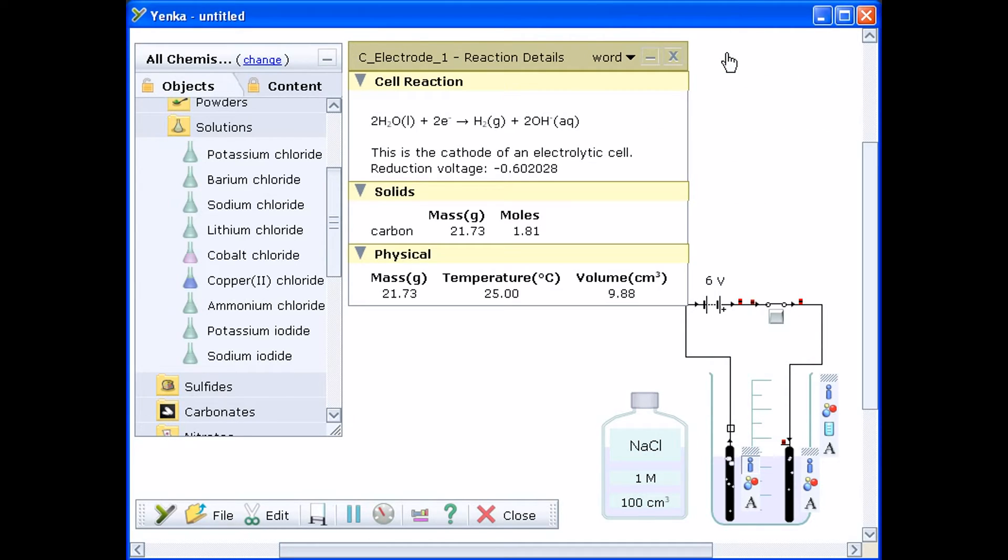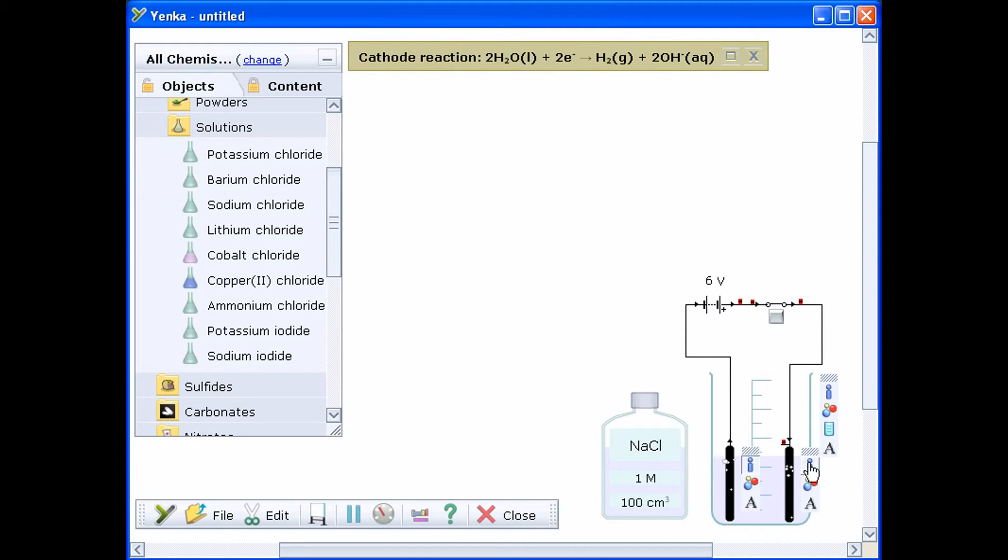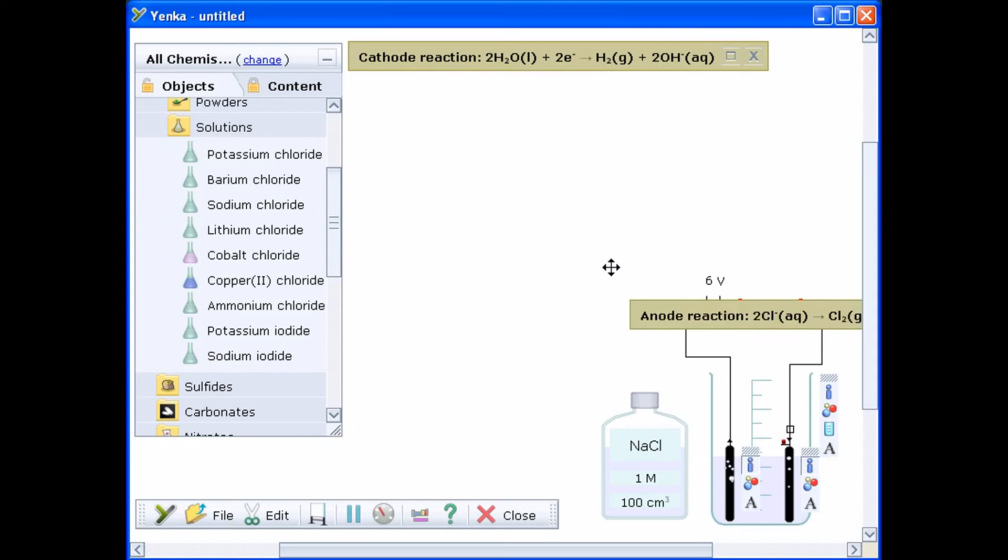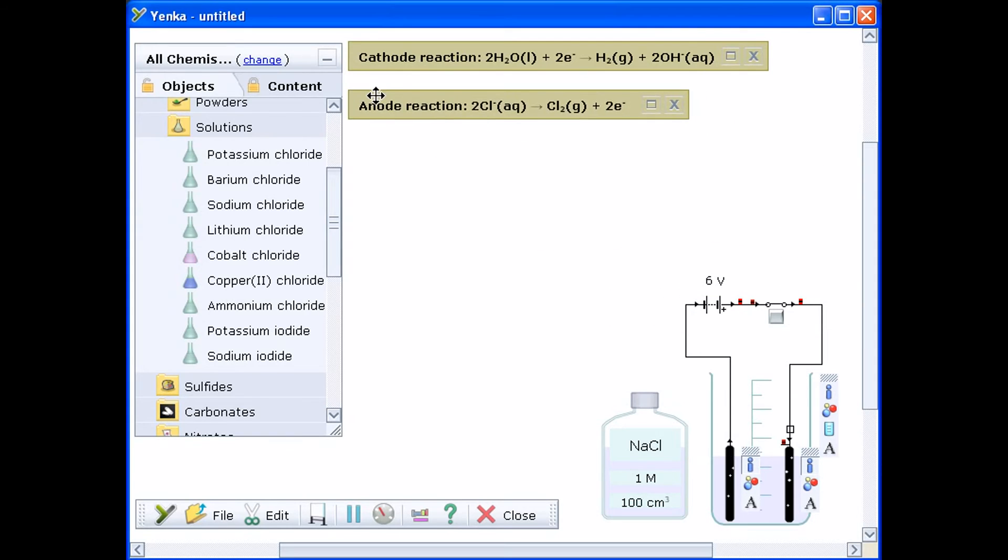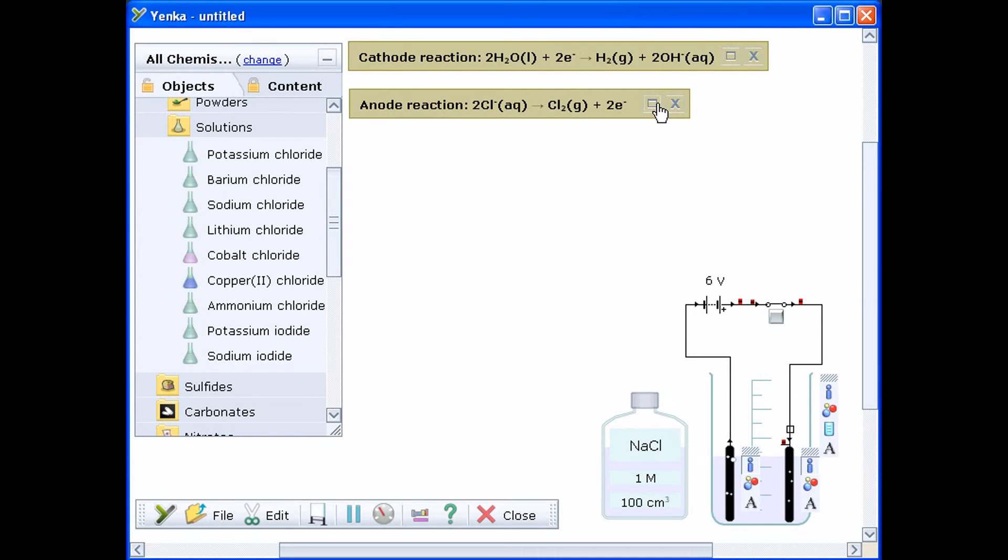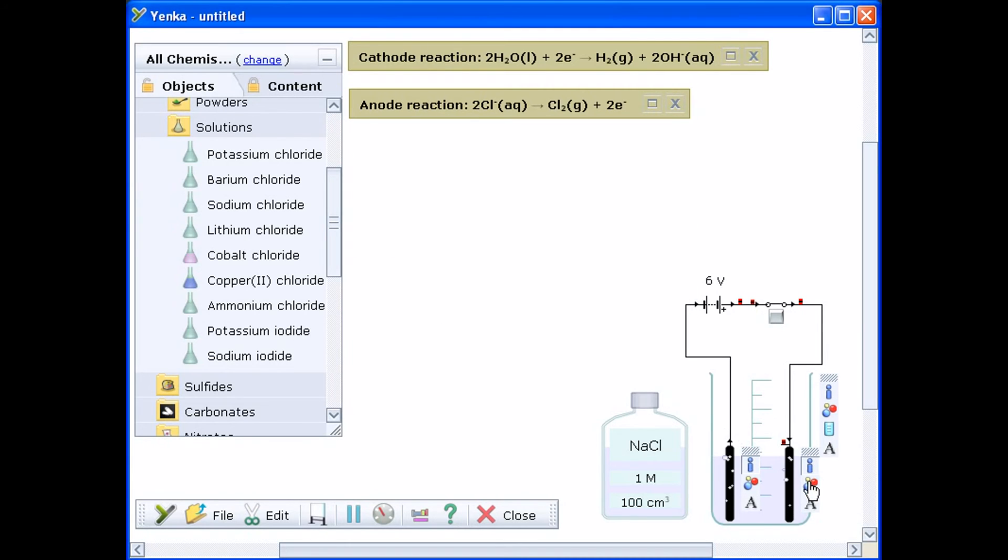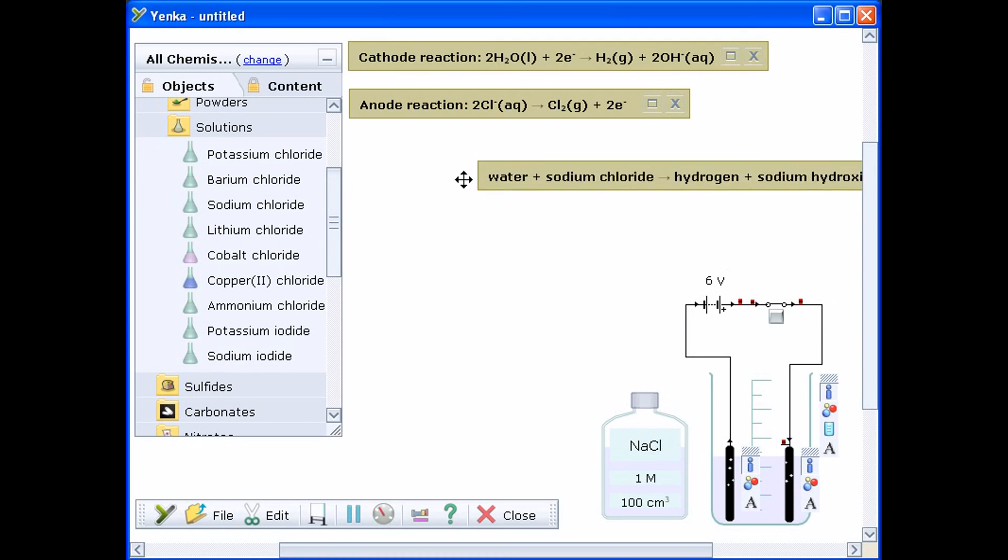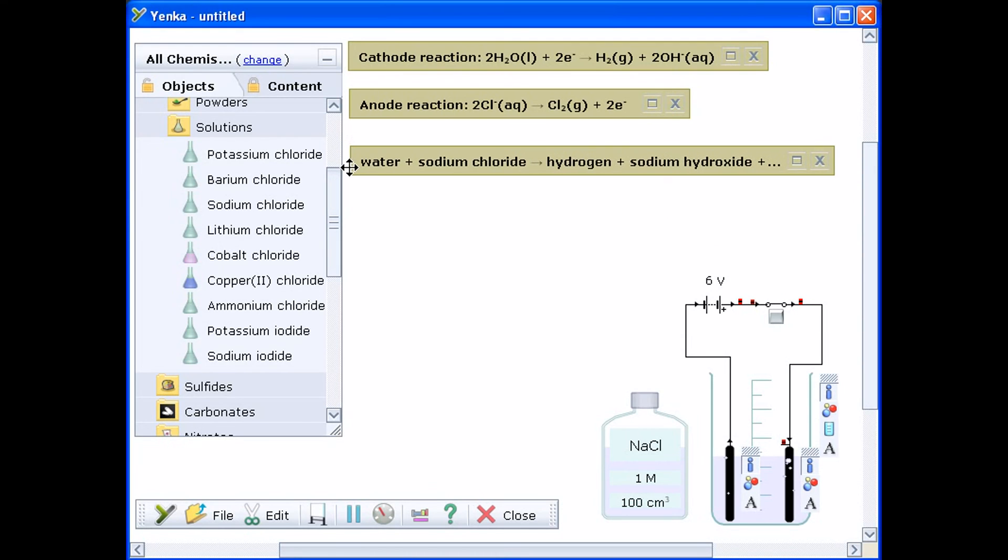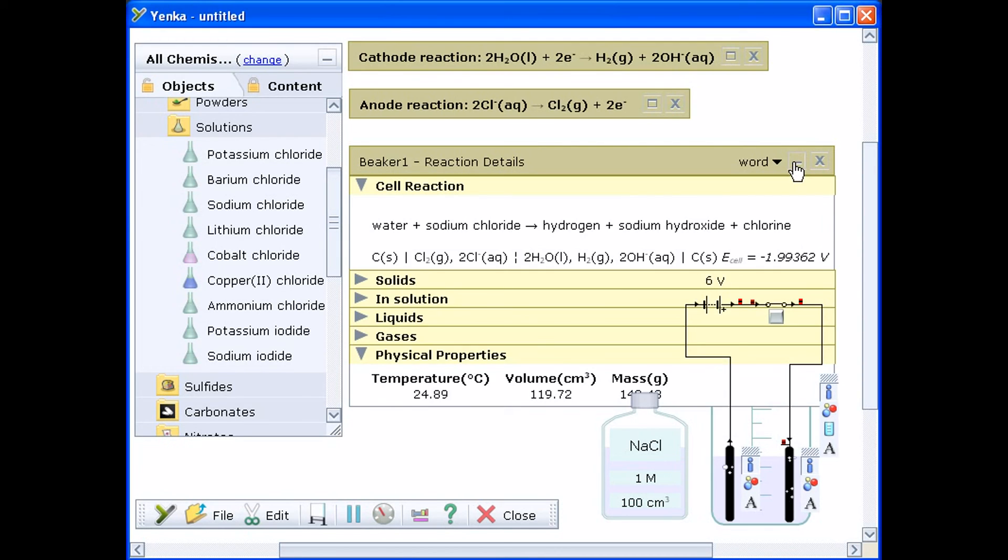Each electrode has a toolbar. Click the top button on the toolbar marked with an eye to see information about the anode and cathode reactions. The button on the reaction window will expand the window to show more information about the experiment. Drag the bottom right corner of an information window to resize it and drag the grey bars to move it.